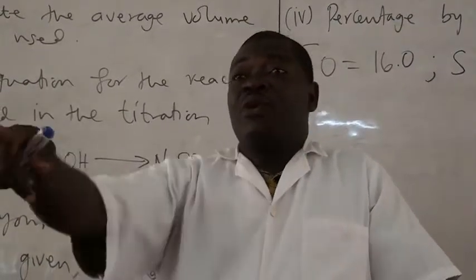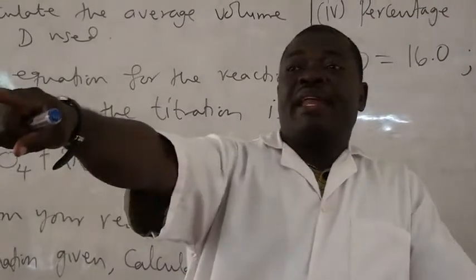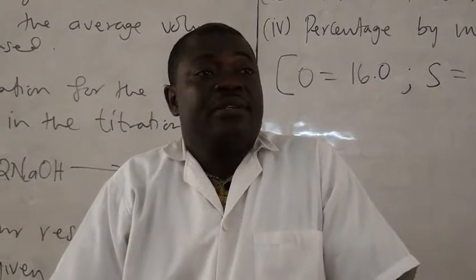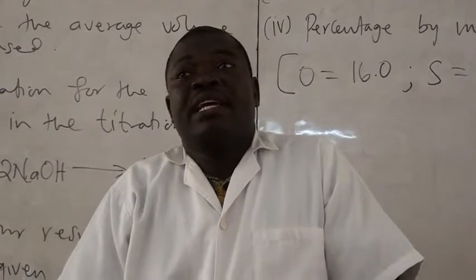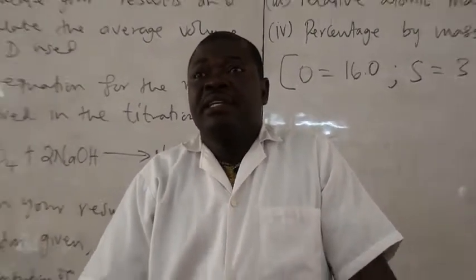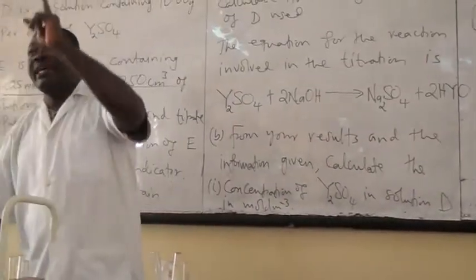No, I said we are going to use it from here. So we have 2 of the methyl orange provided. So when you are in need of it, you just come and then use it. Is that okay? Please, I don't want anybody to be, what do you call it, a passive observer. You are supposed to be an active participant in the work that you are doing. This is not the first time you are doing the titration, so make sure that you do it very well.